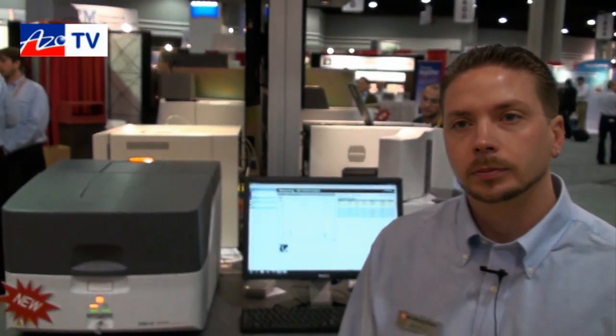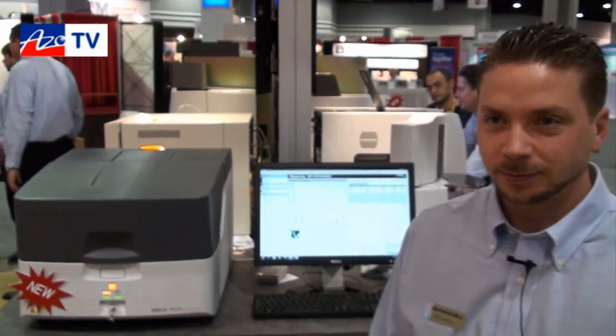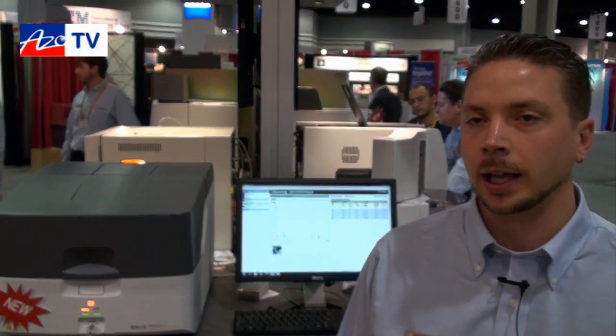You were saying that it doesn't take much training to be able to get up and running using the instrument? No, sir — just simply set the sample in and press start. And what's the detection limit? The detection limit for this will be single digit PPM up to percent levels.